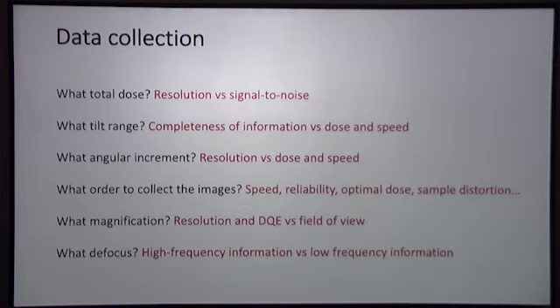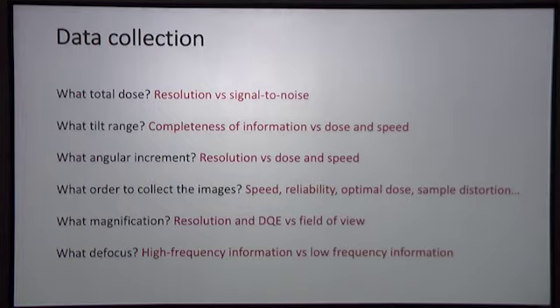And there's also the question of the DQE of the camera. If we work at very high magnifications and then Fourier crop our data down, then we can make use of the very high camera performance at lower frequencies effectively. And finally, what defocus should we collect our data at, which is a balance between high frequency signal and low frequency contrast effectively. So lots of questions to think about before you start.